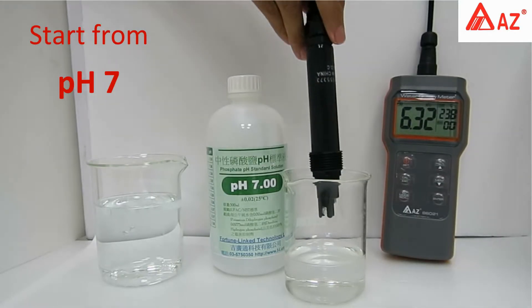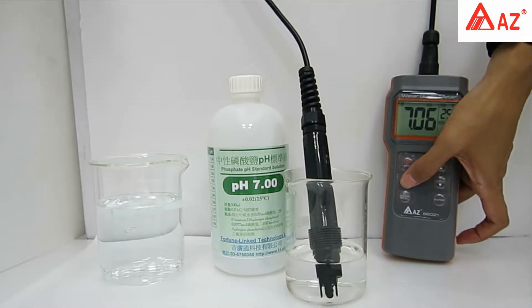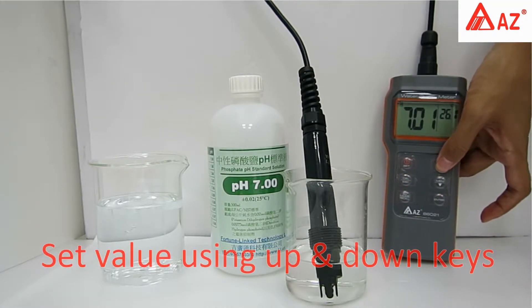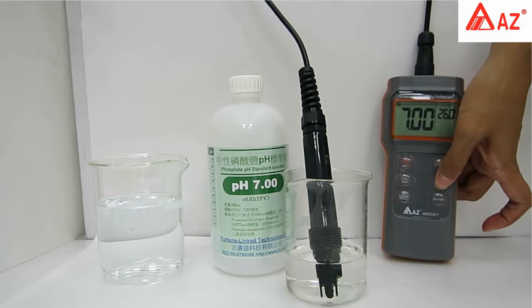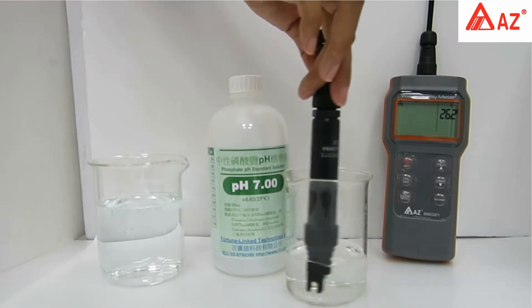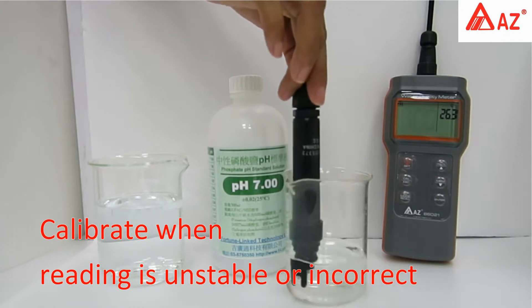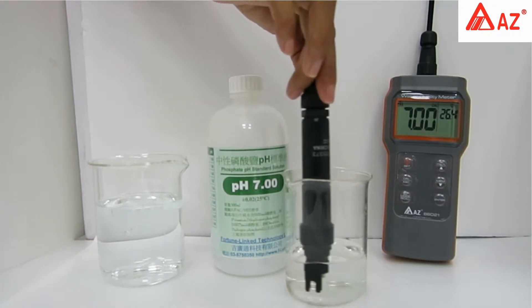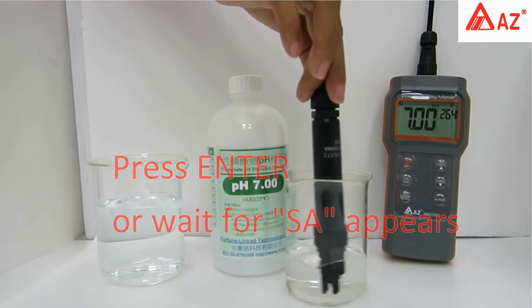For pH calibration, start with pH 7. Long press Cal to enter calibration and set the standard value using the up and down keys. Use a transparent container and make sure the pH electrode is completely immersed in buffer. Stir gently to get a homogeneous condition. Calibrate when pH reading is unstable or incorrect. Do not reuse standard buffer. Once the reading stabilizes, press Enter or wait for the save icon to appear.